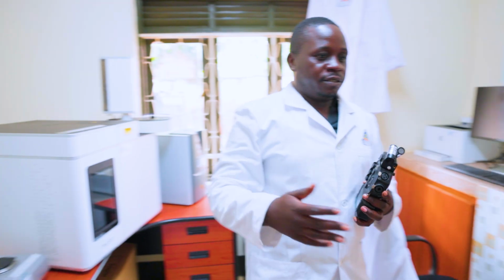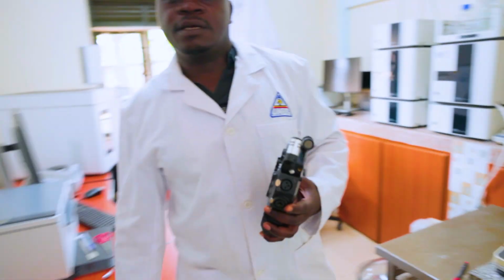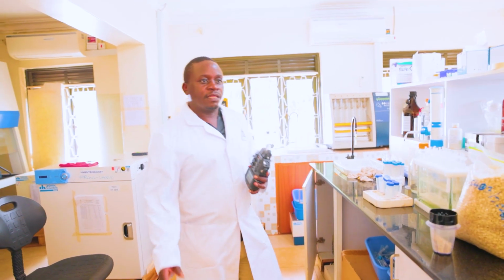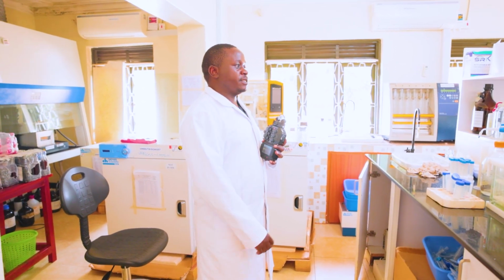And now this is our balance. We do our weighings from this. And then from that we have the general analysis room. It's the general analysis area, where we do the titrations and the classical methods.